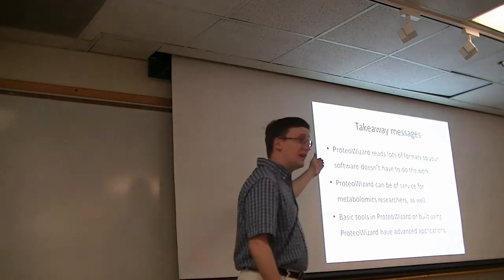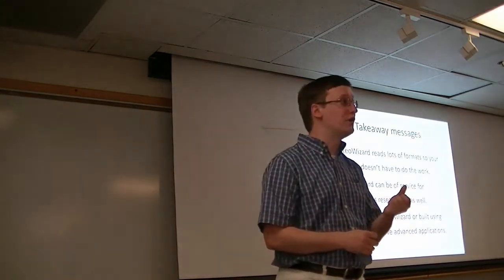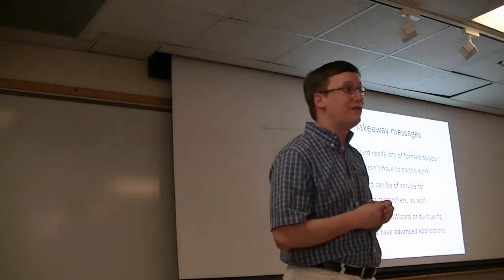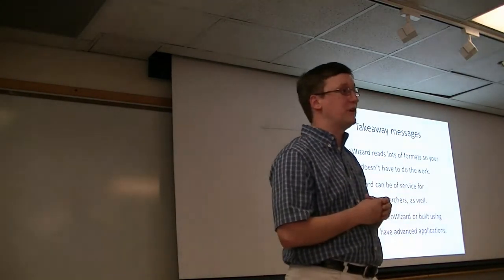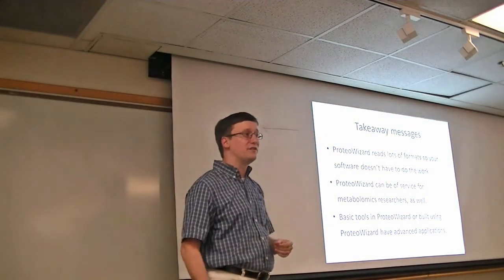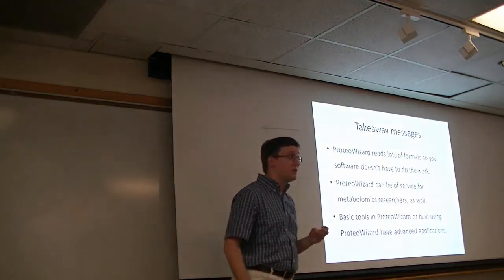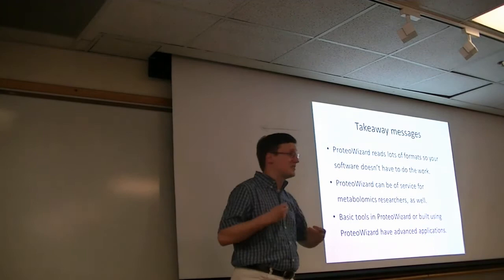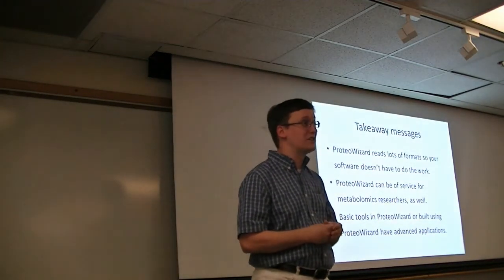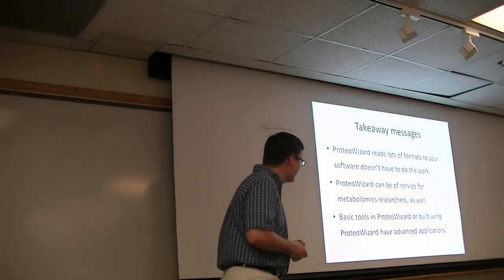All right. Our goal here is that if ProteoWizard is going to do the work for you, you don't have to write yet another raw file reader or yet another mzML file reader. There really are enough of them in the world. So by building on top of ProteoWizard, that work is taken away from you. Certainly, ProteoWizard has a name that suggests it's all about proteomics, but it's just as useful for people working in metabolomics, and all the conversions we're going to be working with in this workshop come from it.